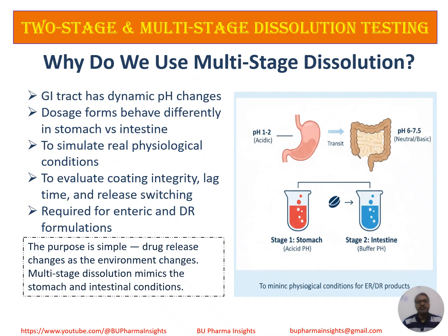A single medium dissolution test cannot capture formulation transitions like acid resistance or intestinal activation. The reason is simple. Drug release changes as the environment changes. That's why multi-stage dissolution testing is used to mimic stomach and intestinal conditions and reflect real in vivo behavior.